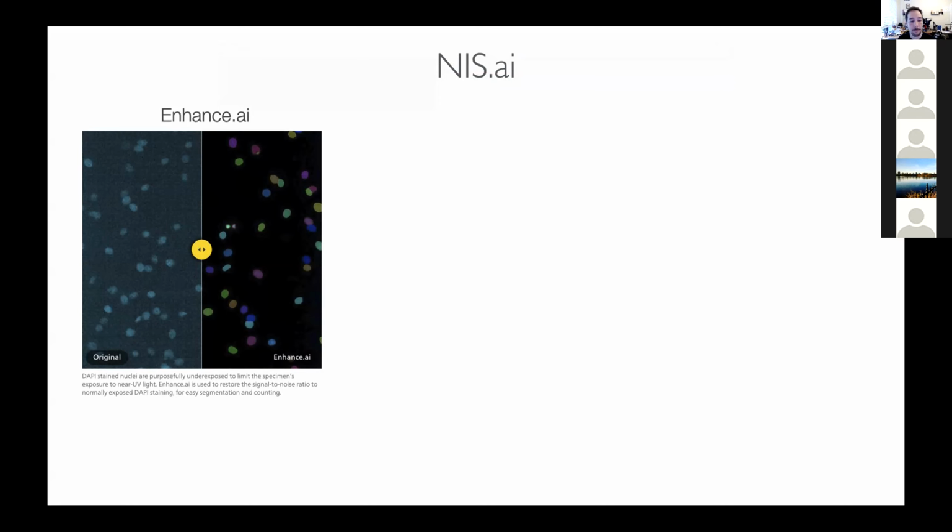the three things we have is enhanced AI, which is really a method of imaging low signal to noise or very noisy images. Say like when you're doing live imaging and you really just can't afford to expose the sample with much light, or you need to image quickly, and then train the network so that when it sees this sort of noisy image, it should really look like this really nicely exposed image.